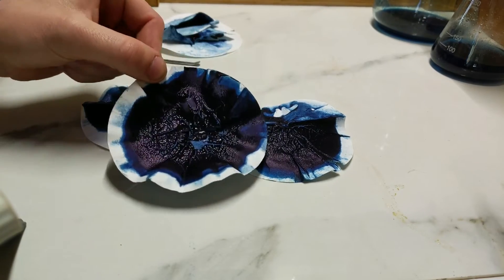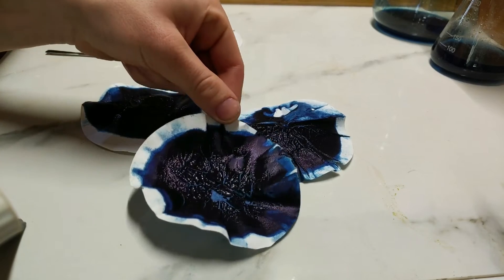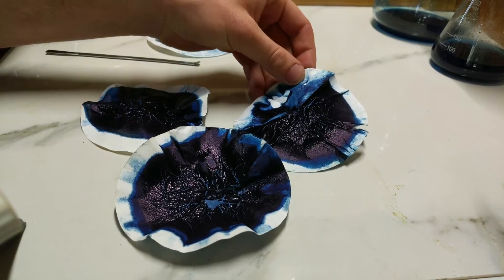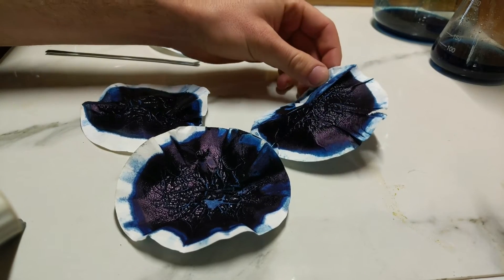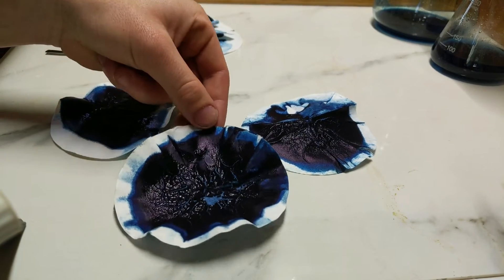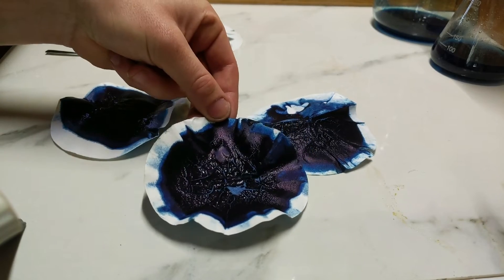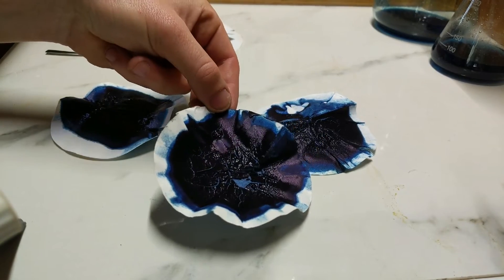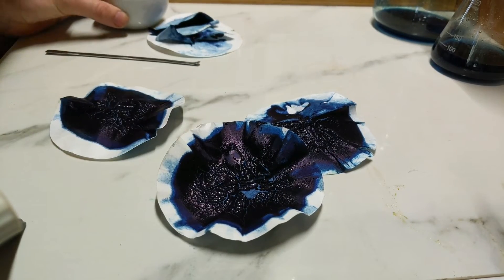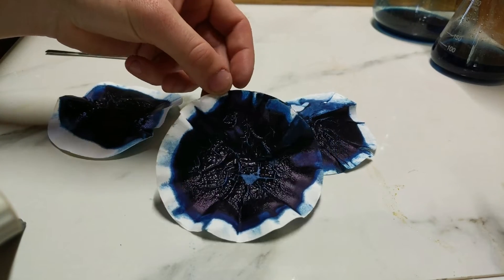Here are the pigments after the filter paper has been dried in the sun since yesterday. It's remarkable how Prussian blue has this purplish metallic sheen to its surface. Now carefully scraping the pigment off the filter paper into a mortar and pestle to grind it down and assess it.